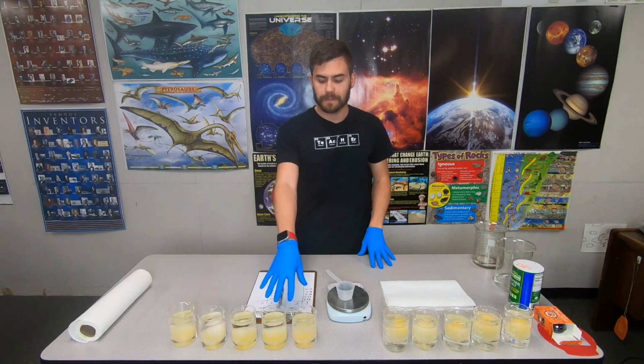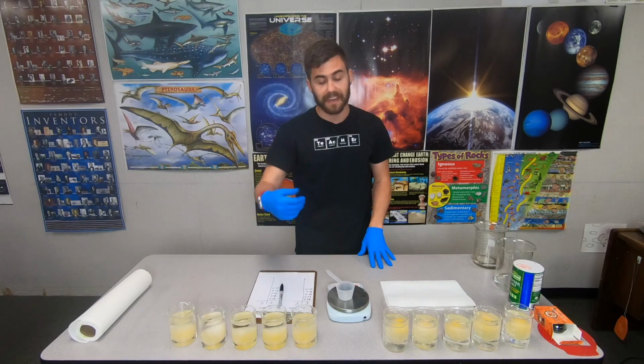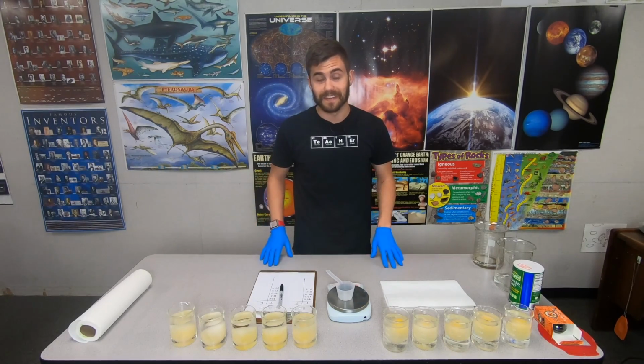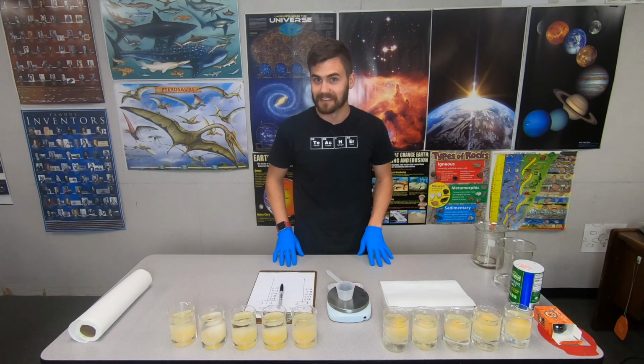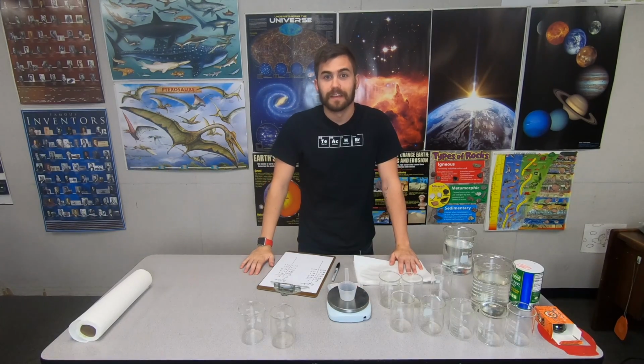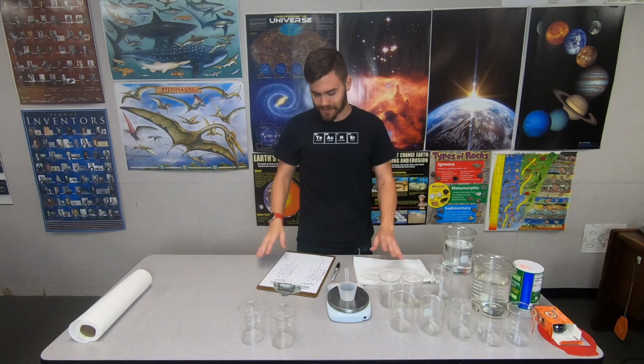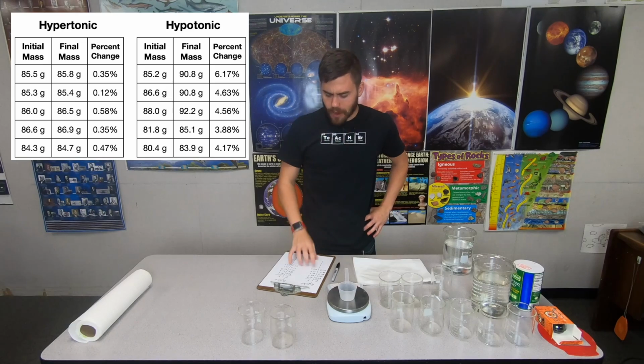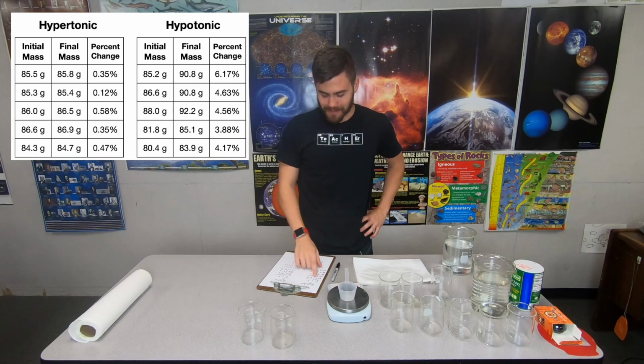So anyways, we should expect these to gain a significant amount of mass because they should have taken on a lot of water. So I'm gonna weigh these and then we'll take a look at the data and see if that is confirmed. Well, this didn't actually go the way I thought it would go. It turns out, here's the data. It turns out that all of my eggs gained a little bit of mass.